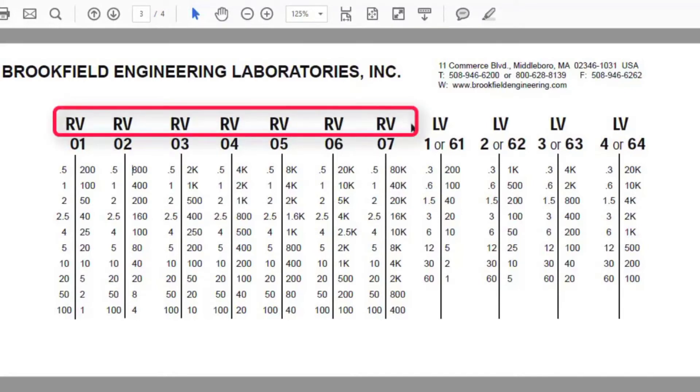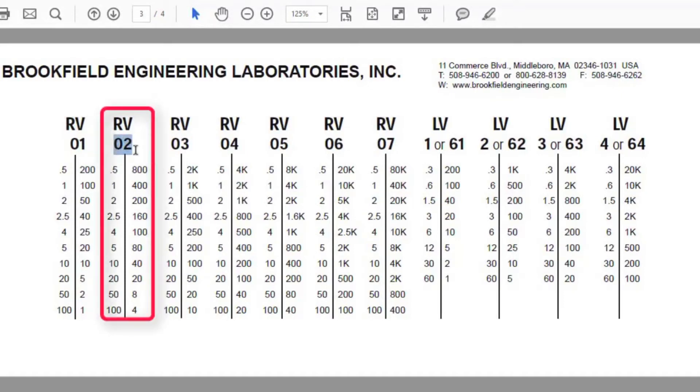Then we can select the conversion chart based on the spindle we used. In this example, a number 2 spindle was used, so the chart titled RV02 was selected.